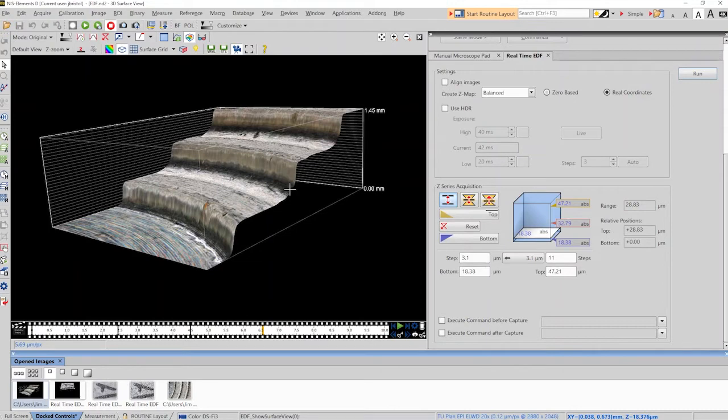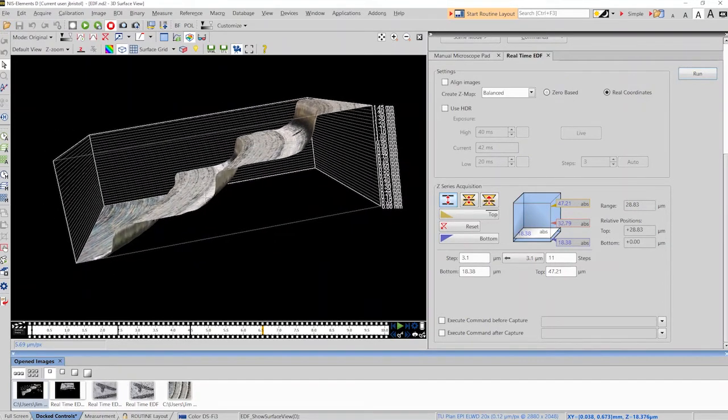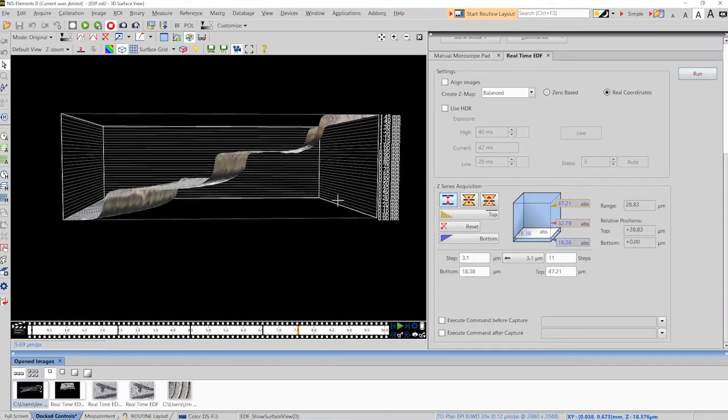I'll now do a left click, and I'll bring it all the way to this position. Update key, 7.5 seconds. And now what I'll do is I'll bring it up so that it's almost perfectly side on side. Update key, make that 9 seconds.